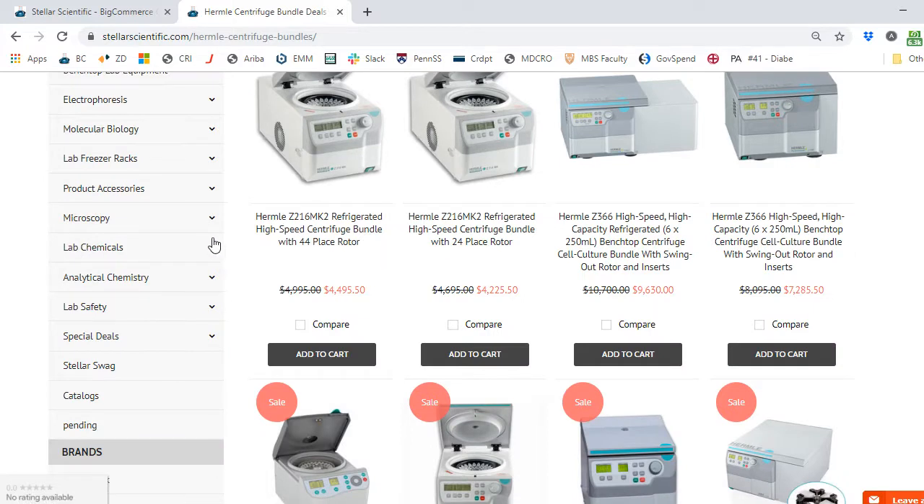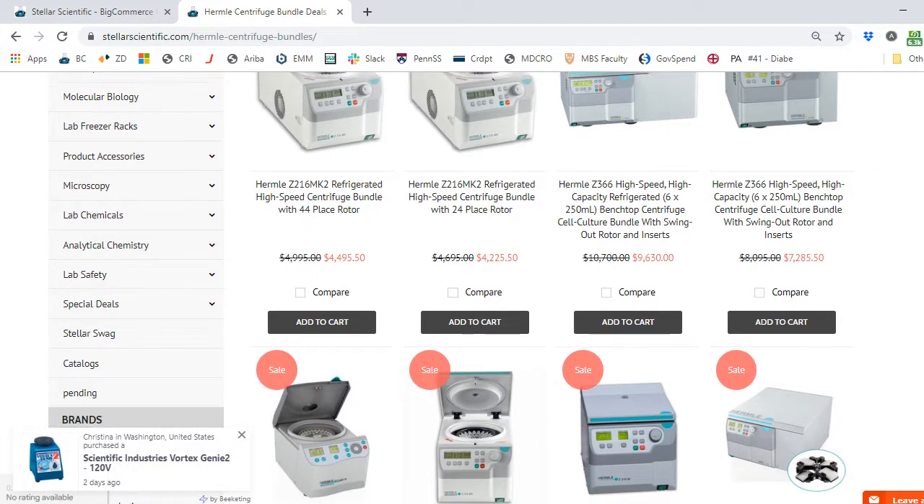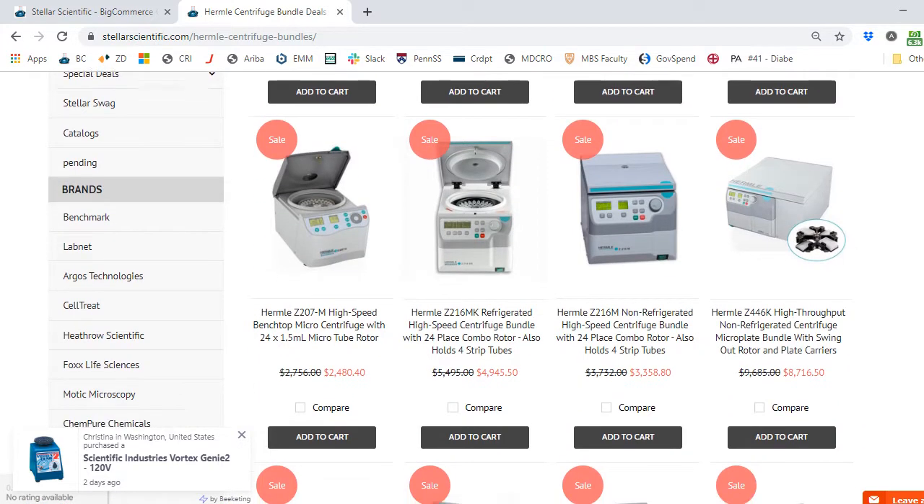If you scroll through, you can see we've got some of the Hermle Micro Centrifuges, and the entire collection of current bundle specials. These are divided based on capacity and maximum speed. The bundles will tell you, at least in the product description, what kind of package it is. For example, here I'm highlighting the Hermle Z366 high-speed, high-capacity, refrigerated benchtop centrifuge — the cell culture bundle with swing-out rotor inserts. You'd click on the product itself to go to the product page to see the capacity. We've got a 6x250 mL capacity option over here.